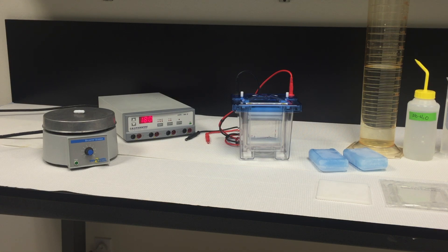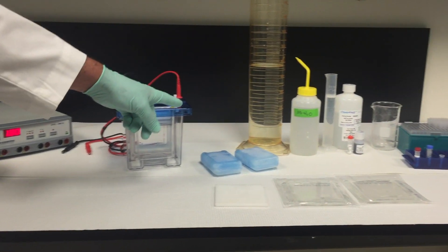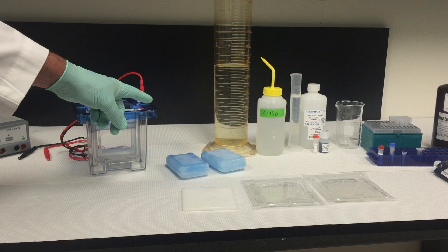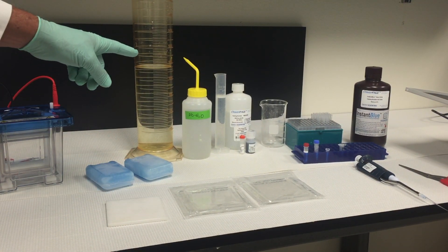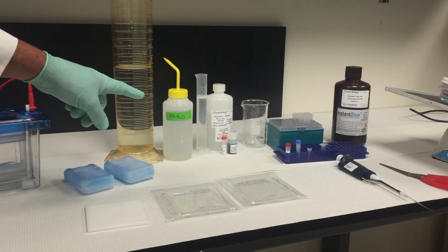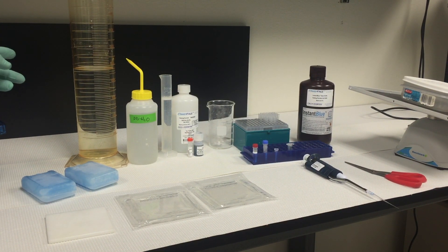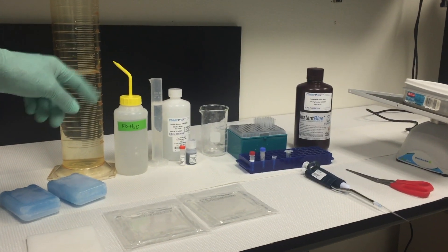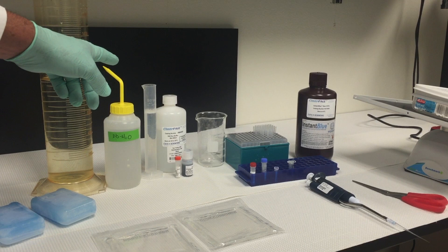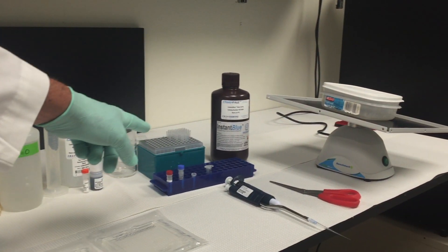You will need the following: a stir bar and stirring platform, a power supply, a DCX700 unit, optional freezer blocks, ClearPage gels, ClearPage running buffer, ClearPage sample buffer, UltraPure water for buffer dilution, a squeeze bottle for gel washing, a graduated cylinder for buffer preparation, a pipetter, and prepared samples.